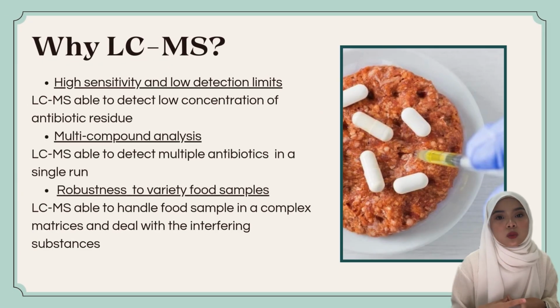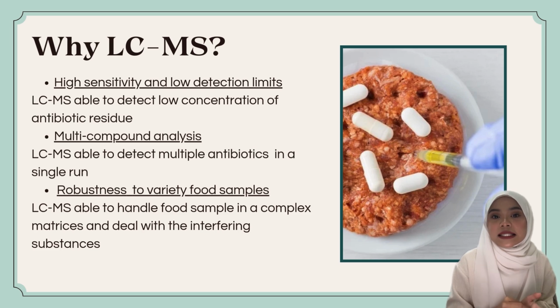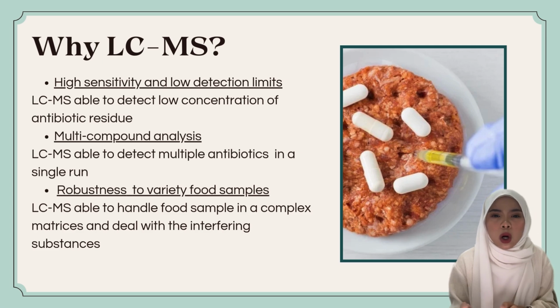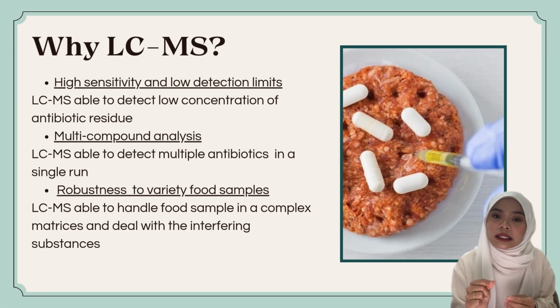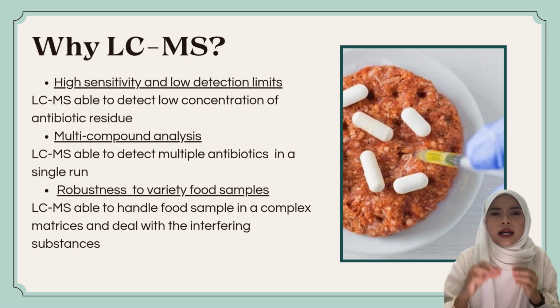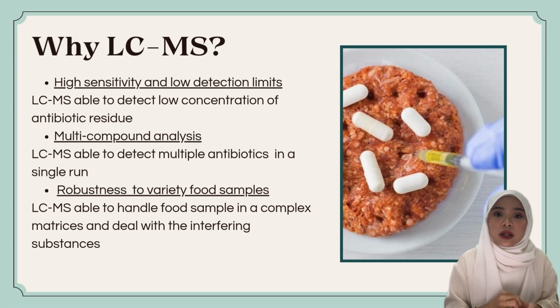Next is the reason why LCMS is chosen instead of other non-spectroscopy methods. The first reason is because LCMS has high sensitivity and a low detection limit. LCMS is able to detect low concentrations of antibiotic residue. Compared to this, other non-spectroscopy methods lack sensitivity, making them less suitable to detect extremely low antibiotic residue levels.